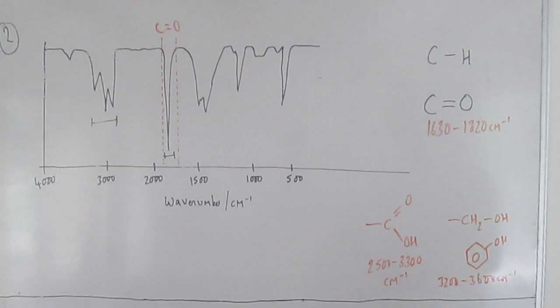Both of those are in relatively empty parts of the spectrum, so again they're easy to interpret. We'll look for those in a minute, but let's first look at some of the later spectra to see what those actually look like, and then we'll come back and see whether we think there are any here.